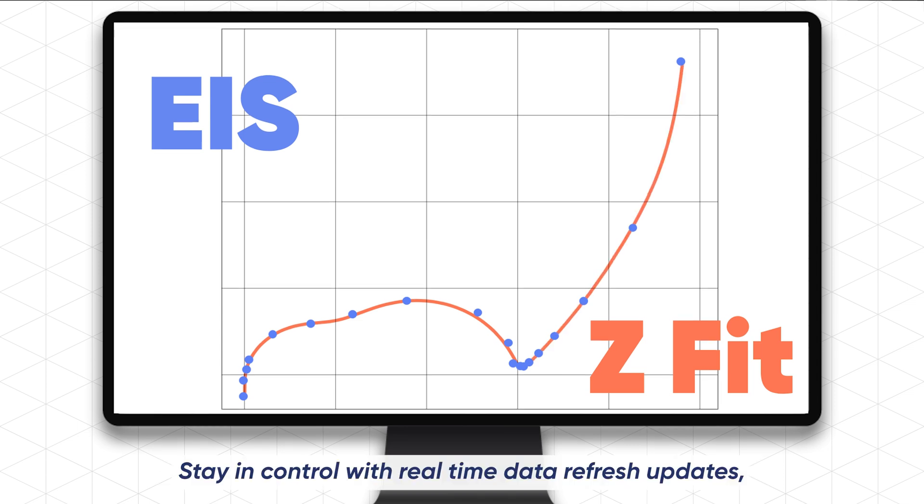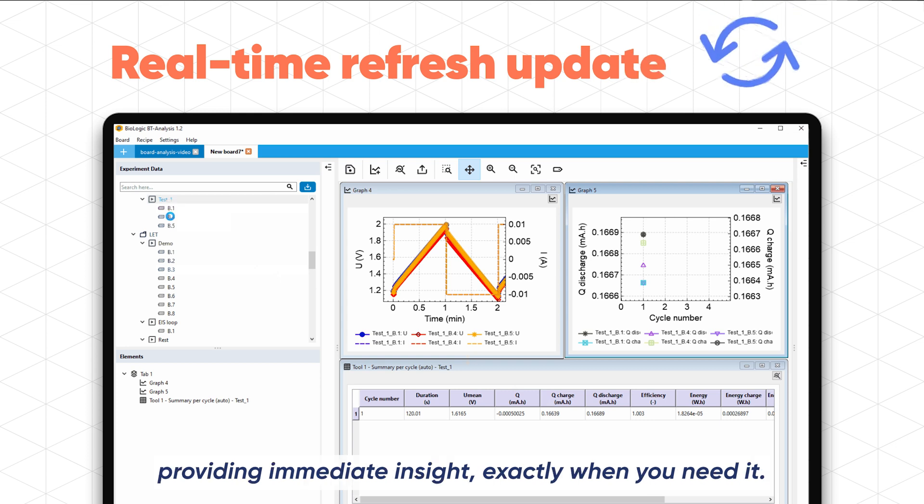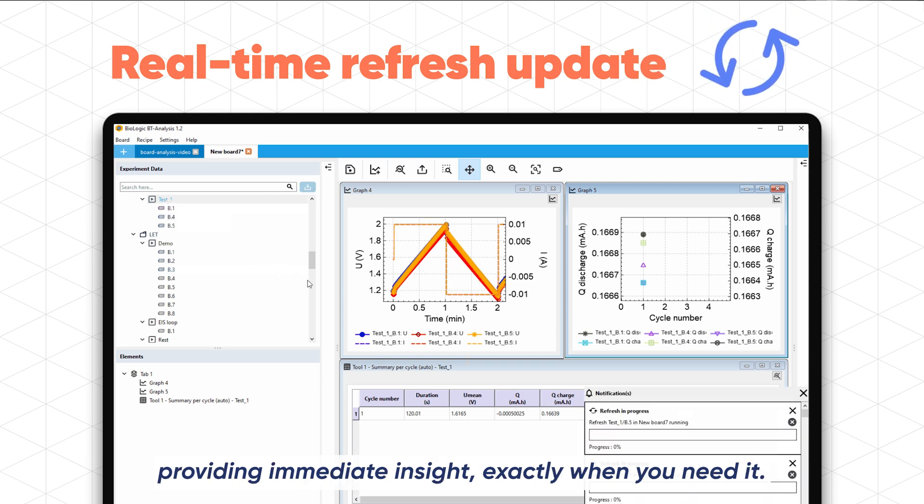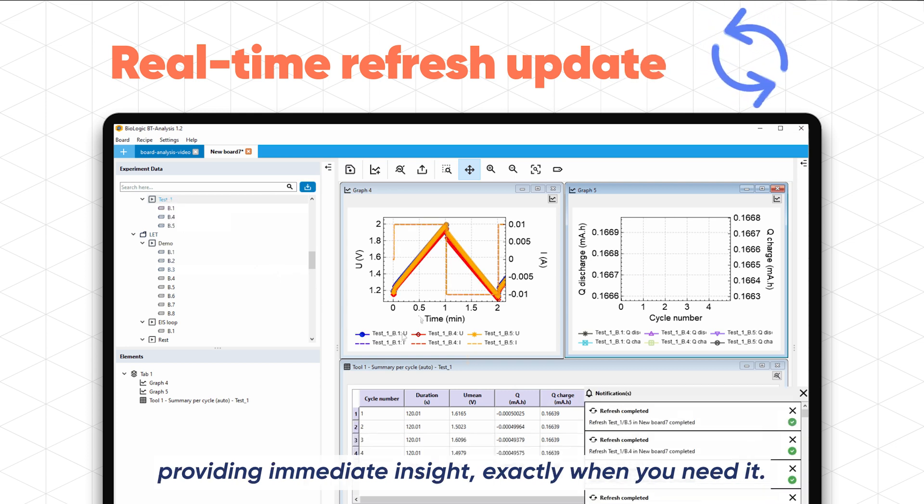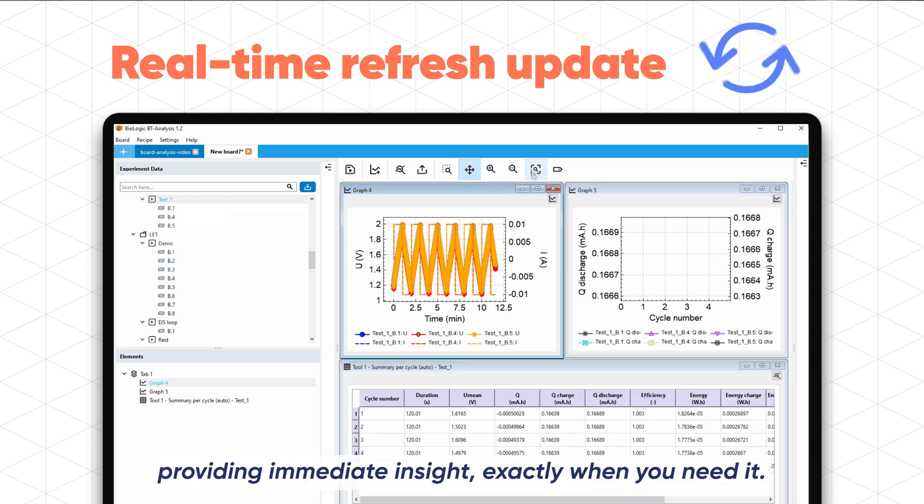Stay in control with real-time data refresh updates, providing immediate insight exactly when you need it.